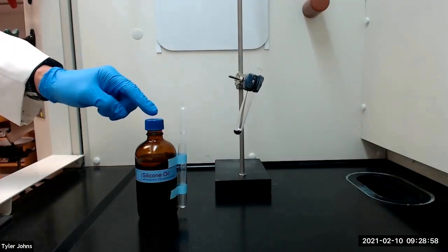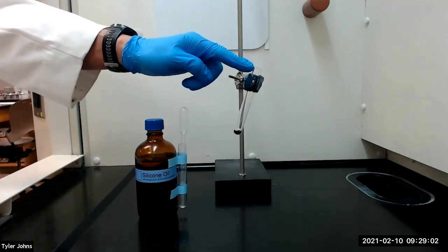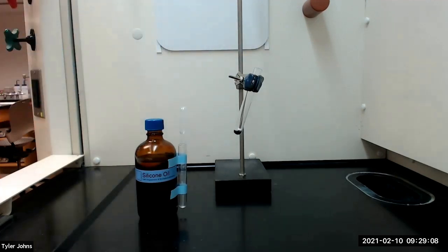We will next add one milliliter of high boiling silicone oil to the test tube, and you want to make sure that you've clamped the test tube at a slight angle facing away from you and your neighbors.